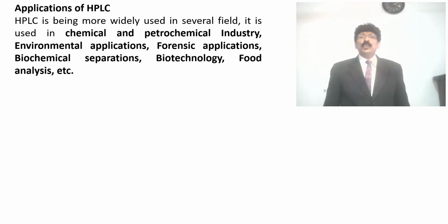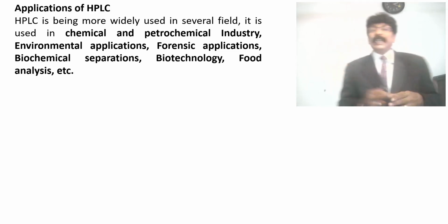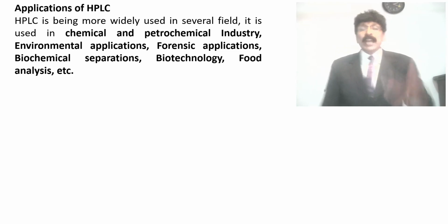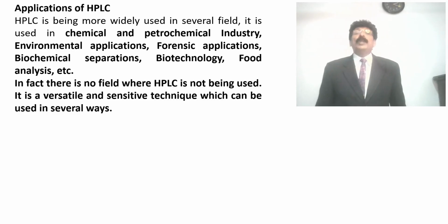It is used in chemical and petrochemical industry, environmental applications, forensic applications, biochemical separations, biotechnology, food analysis. In fact, there is no field where HPLC is not being used. It is a versatile and sensitive technique which can be used in several ways.